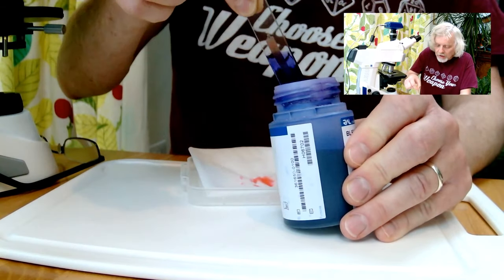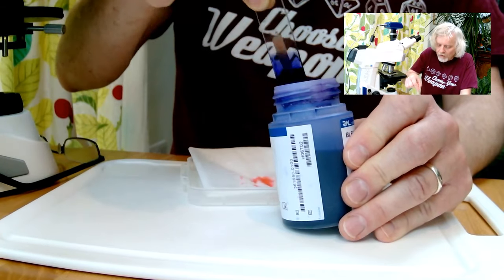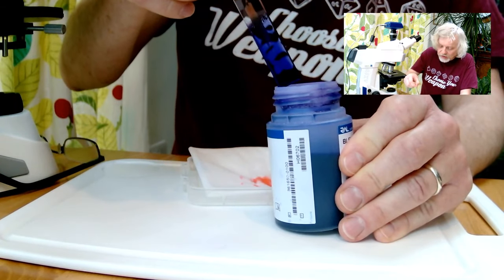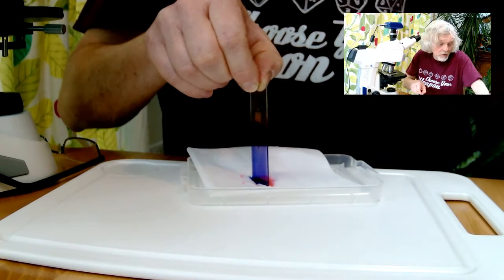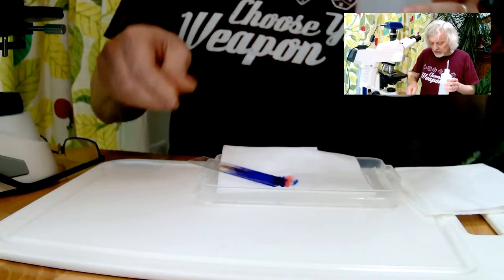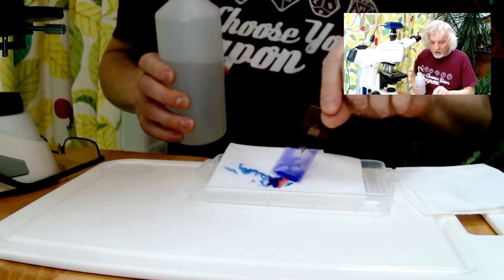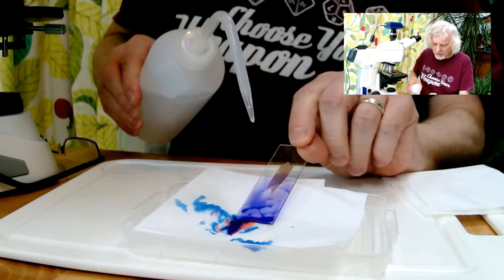One, two, three, four, five. And I tend to overstain with this one, so I'm doing that quite quickly. And get rid of that. And then what I need to do is wash this slide, so I need to get rid of all the excess colour, so to speak. And I'll move that forward so you can see what I'm doing.